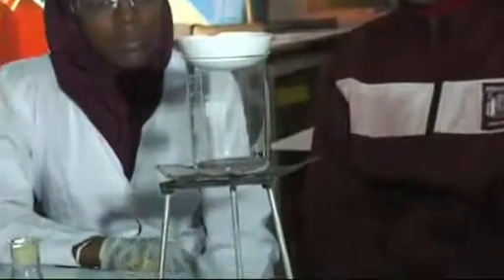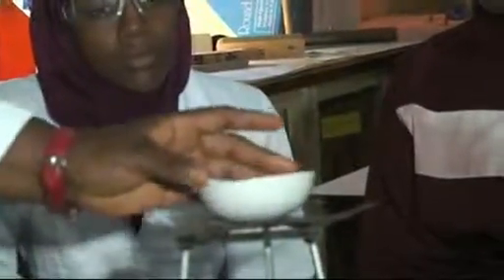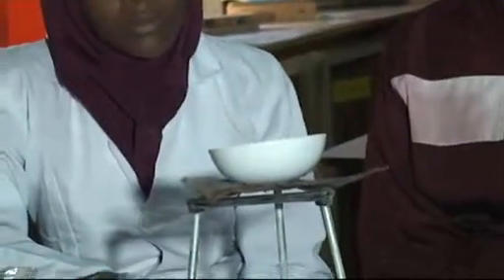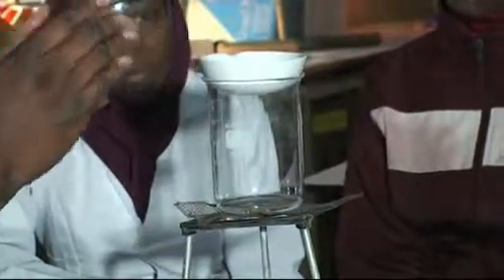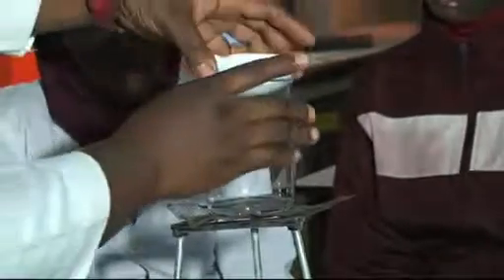Now the difference between the two methods is this. The first method, which is direct evaporation, is faster. But by the time it gets to the end, the salt will start spitting out. So you cannot recover all the salt that you have lost. But if you use indirect heating, like this, indirect evaporation will allow you to get all the salt back but it takes time. So this is the difference. Now what we'll do is this.